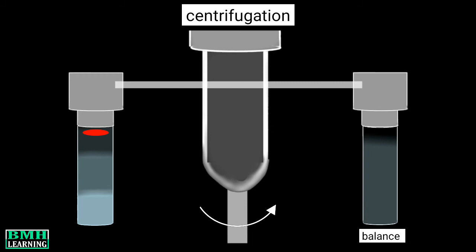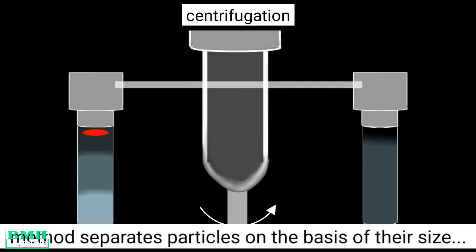On centrifugation, particles move away from the starting zone with velocities determined by their size, shape, and by the centrifugal force to which they are subjected. So we can say the method separates the particles on the basis of their size, as compared to isopycnic centrifugation, which uses buoyant density for particle separation.